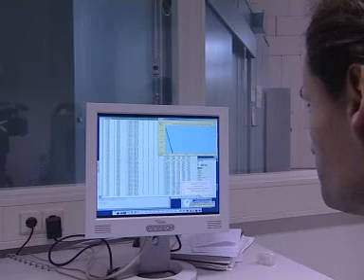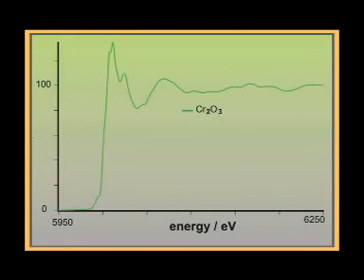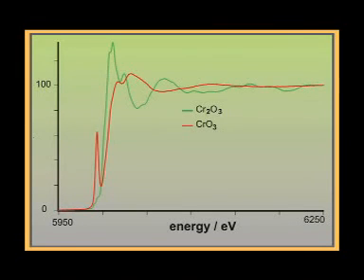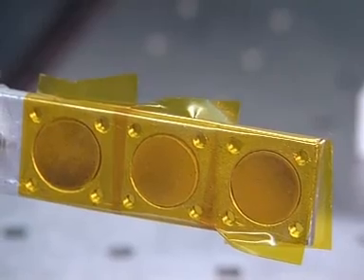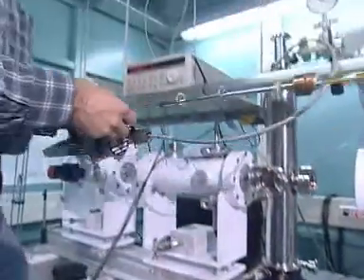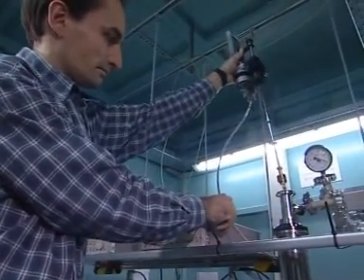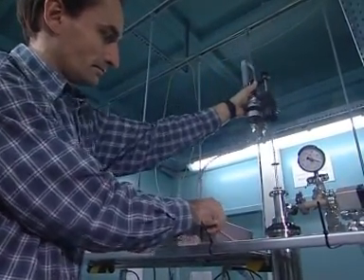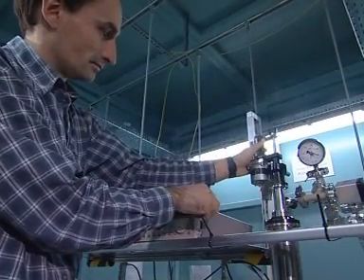Chemists nowadays use the fine structure characteristics of the X-ray spectrum for soil classification by comparing toxicity levels and, in this way, avert health hazards. Each oxidation state gives rise to a characteristic fingerprint in the spectrum. The light required for examination is filtered out of the white spectrum of synchrotron radiation by means of a monochromator. Detectors used to determine light intensity measure the power absorbed by the specimen under study.